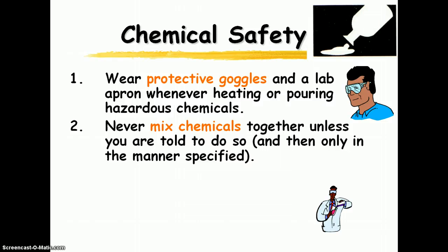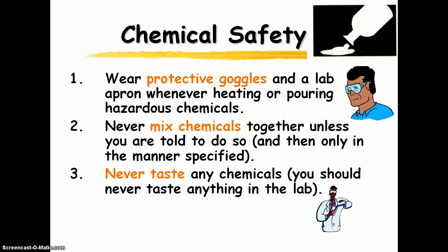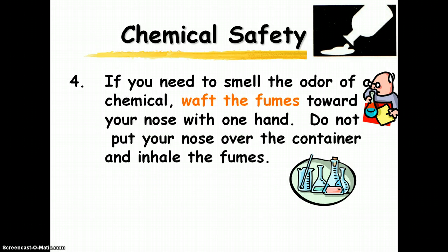Mixing chemicals that aren't supposed to be mixed can become explosive, poisonous, or produce poisonous fumes — so don't do that unless you are told to. Again, no eating or drinking, and never taste anything in the lab. There's a special way to smell things in the lab — I'll demonstrate this in class. You never directly put your nose over a container and inhale the fumes; instead you use this wafting motion.